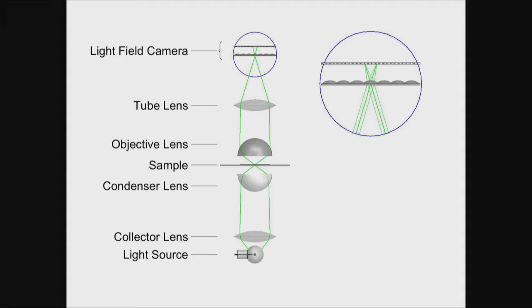And so you sample the different orientations behind these microlenses. And then you go one microlens over, one microlens over. You still sample the volume spatially, in terms of position, and in angle. So it's a hybrid data set that you have here. And it really is tomography. You can think of it as tomography in that you know how much light has gone through, and what, for example, the polarization history is of that light if it goes through the sample in different directions.